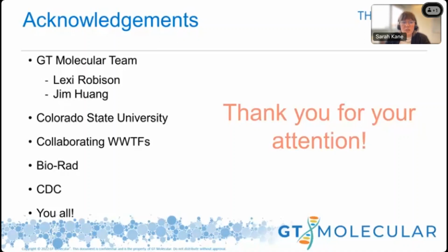Okay, so it looks like Shireen wants to know which AMR gene targets we are working to develop for wastewater monitoring, and there is a lot. So we have a lot of beta-lactam resistance genes, vancomycin, colistin resistance, and again, these are all under the guidance of the CDC, and it represents a pretty big chunk of the panel. So happy to take that offline and show you our list if you're interested, knowing of course that they are subject to change by the CDC.